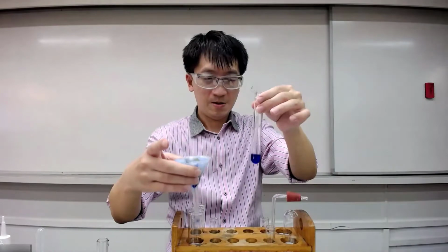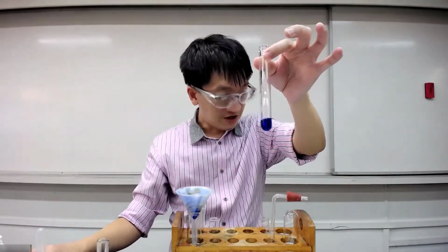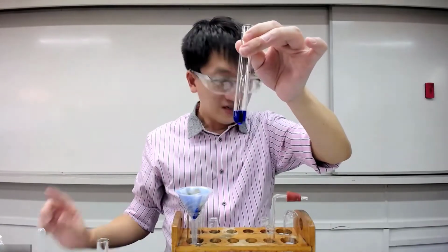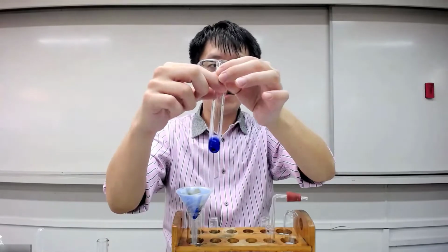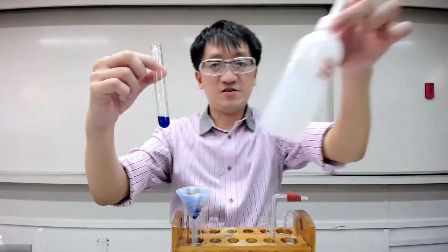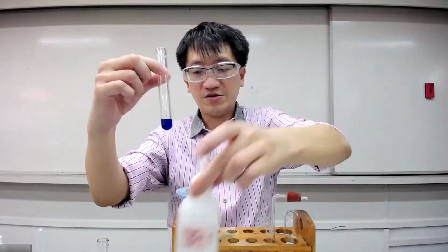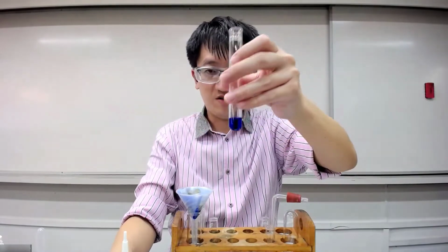Okay. And then for this filtrate, I'm going to add in sulfuric acid. Now this portion, a lot of students don't get the correct results. So I'm going to take sulfuric acid first. So this sulfuric acid, I'm going to add it in, and then I want you to observe.